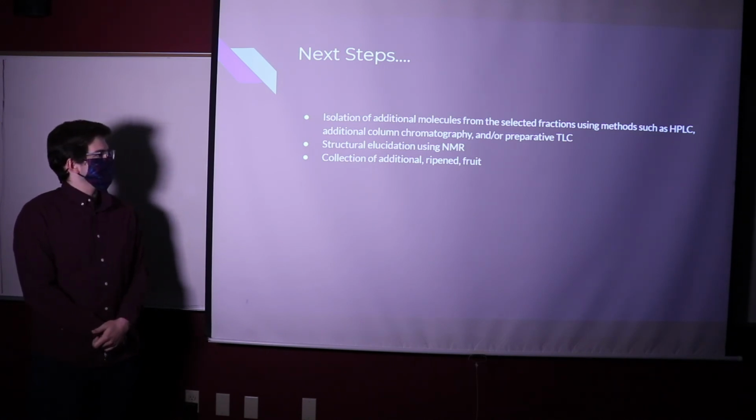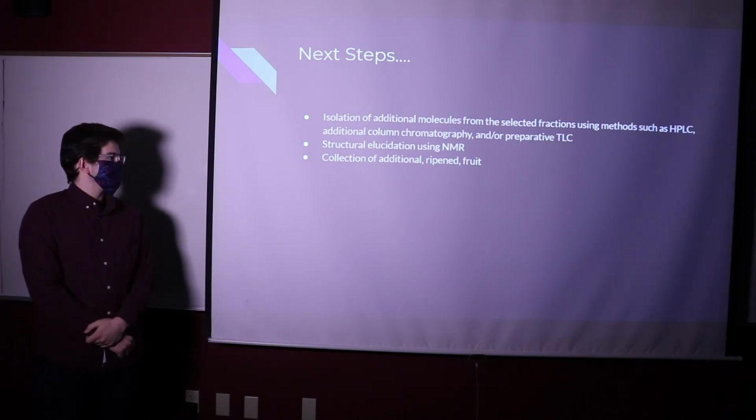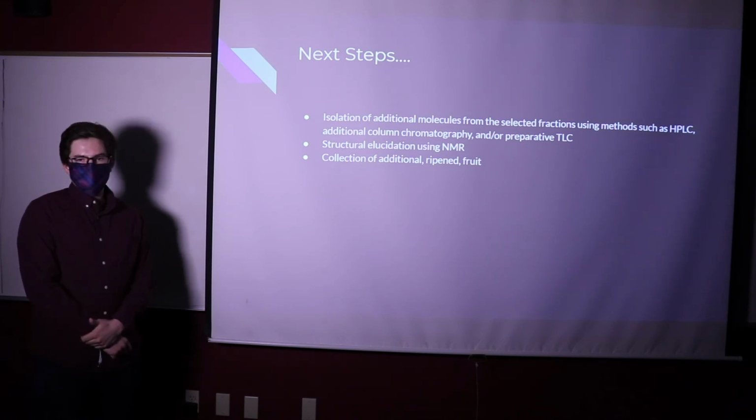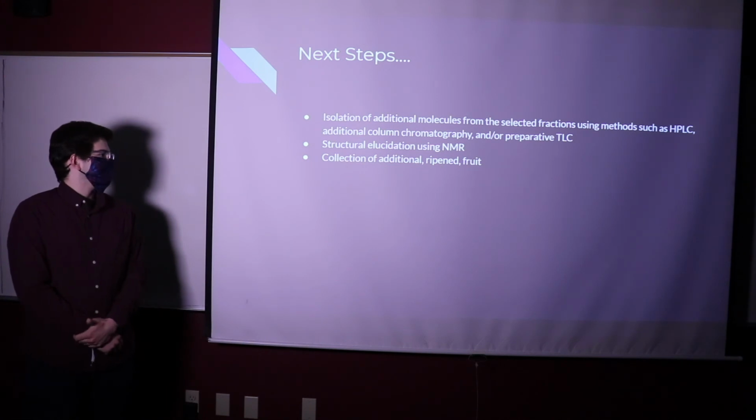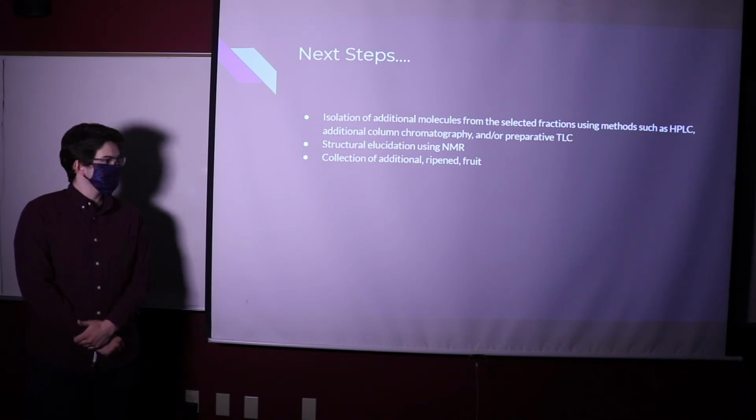And it was also discussed that using the HPLC to isolate more compounds from some of the ethyl acetate samples would be useful. And there's also preparative TLC, which would again help further this project. And also collection of additional fruit to provide more extract for future experimentation would also be very helpful.